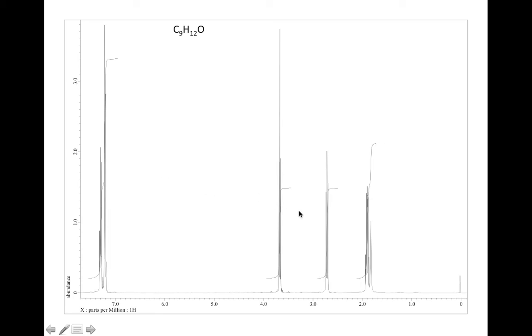The next thing you'll want to do is use the chemical shift ranges to give you some information. So some of these peaks, obviously this one's coming up, this one's coming way up. So by using that little handout on chemical shift ranges, and eventually you should just be able to do that from your own experience, you'll be able to assign some of these peaks to certain environments. In some cases you won't know necessarily what they are, but you get some clues from that.